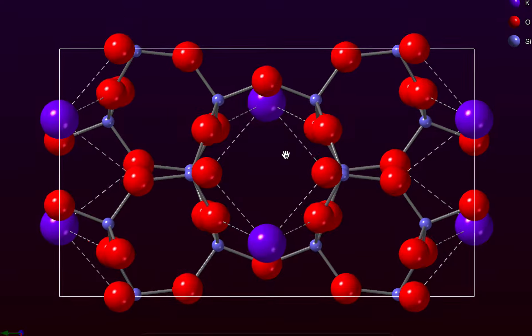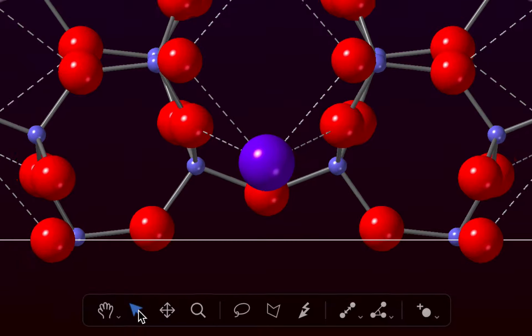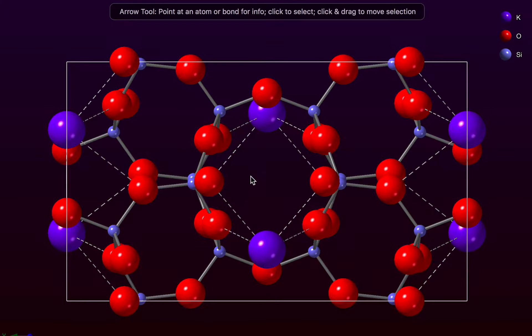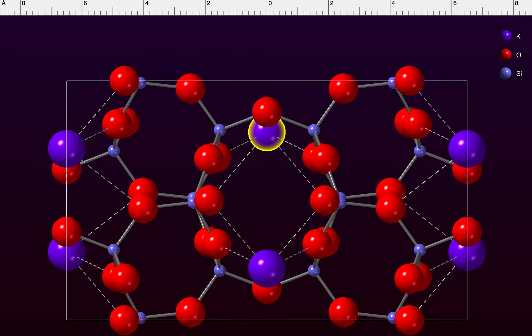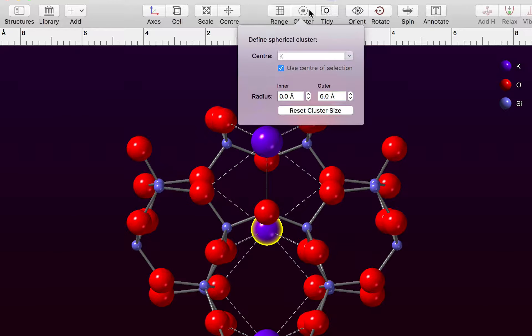We can move down to the tools palette and choose the arrow tool. Then if we select an atom of interest like this potassium atom, we can go to the cluster button in the windows toolbar. We instantly get a spherical cluster of atoms displayed on the screen.